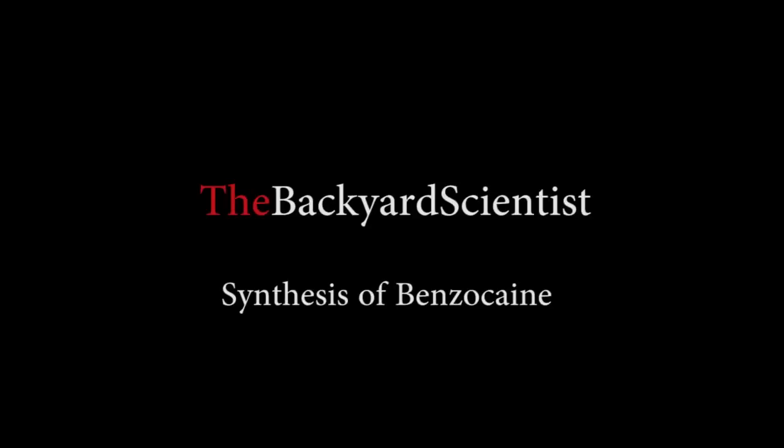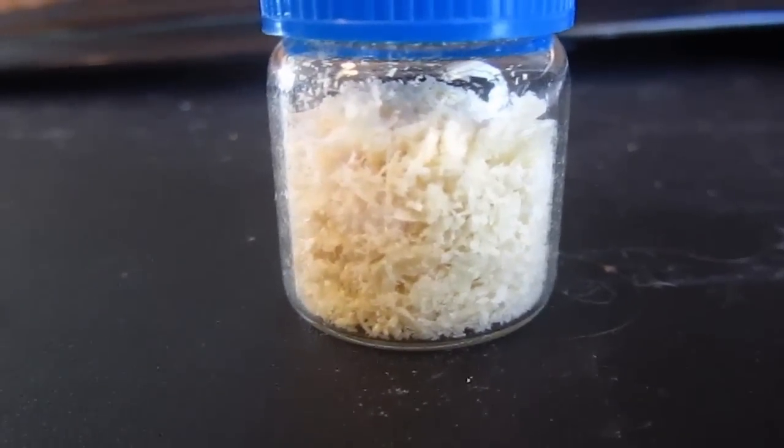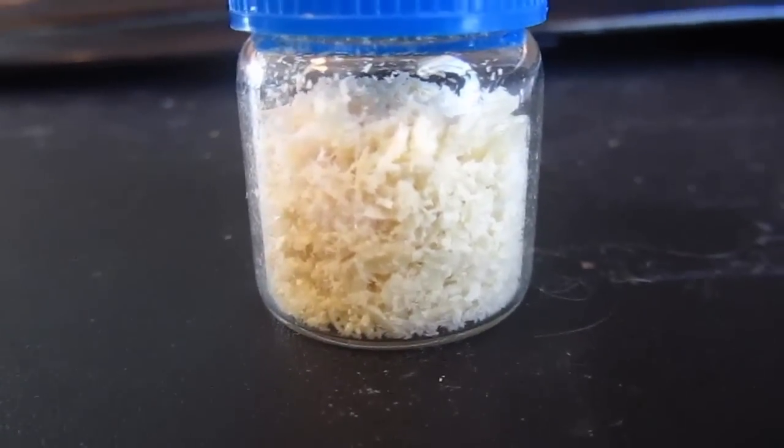Hello, hello, Backyard Scientist here, and today we're going to be doing a synthesis of benzocaine. Yes, it is a topical anesthetic that numbs your mouth.